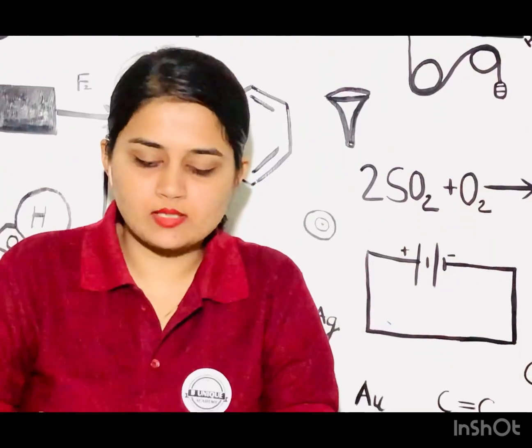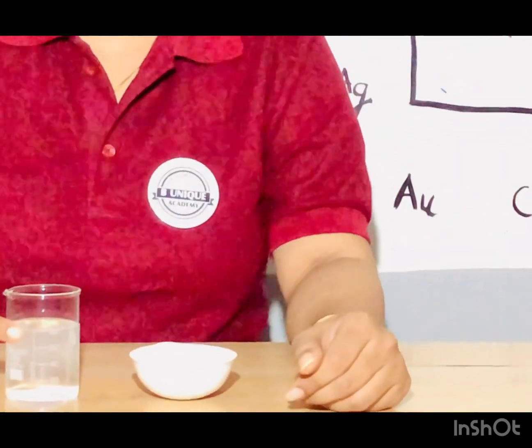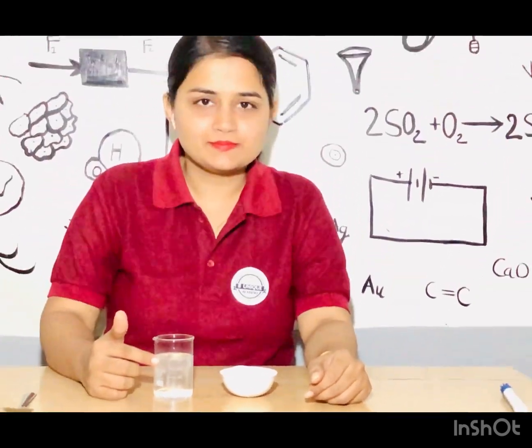Again, let us observe the level of the water in the beaker. Here you can look that the level of the water did not increase, it remained the same, 80 ml.